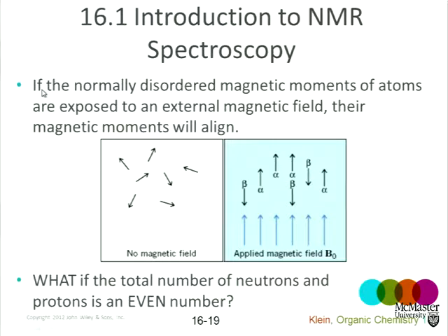This is mostly physics. This is mostly about how NMR works. We take a sample that contains spinning nuclei, and in the example from last week, those nuclei are carbon-13 nuclei, and they have nuclear spin. They could be forms of proton nuclei that we'll talk about in a minute. So these little nuclei spin in the absence of a magnetic field. They spin around random axes, and they create little magnetic moments that point, therefore, in random directions.